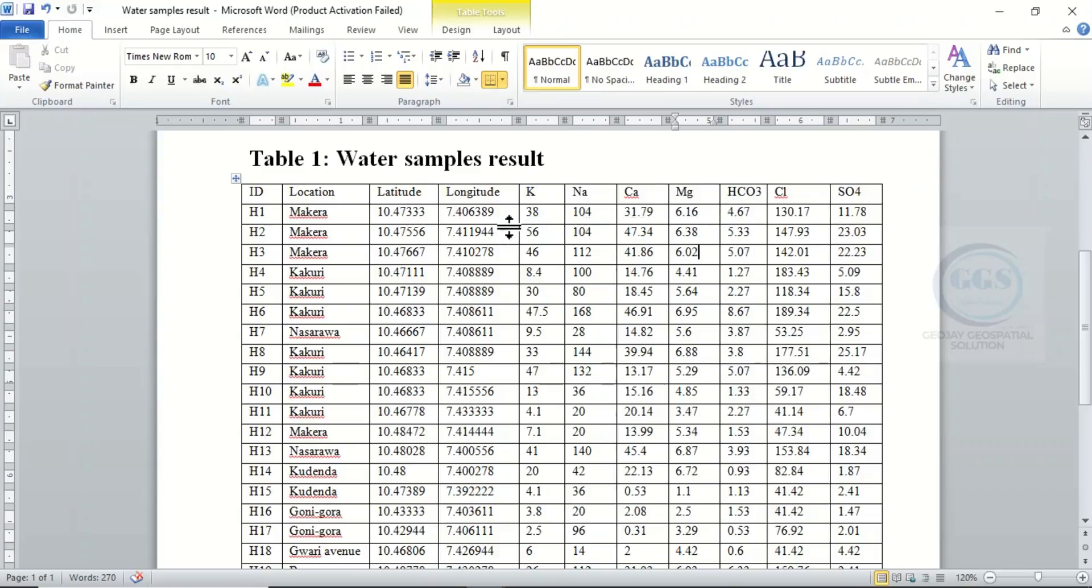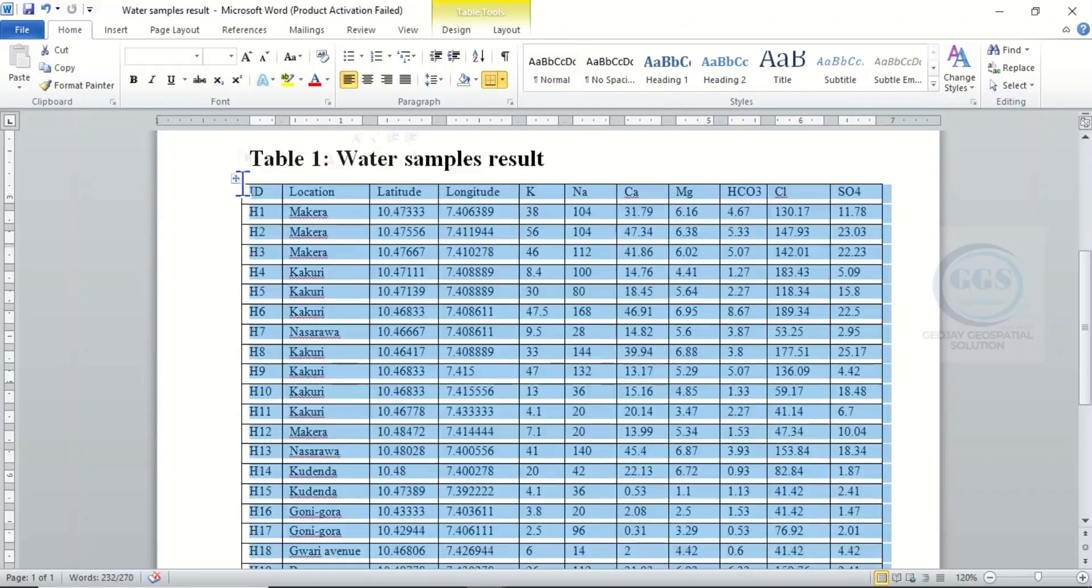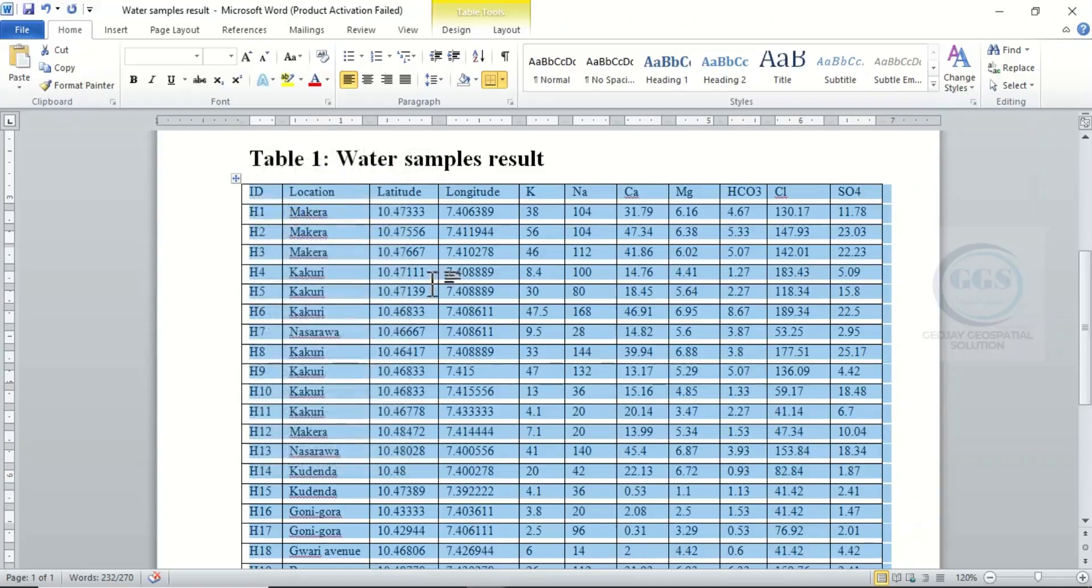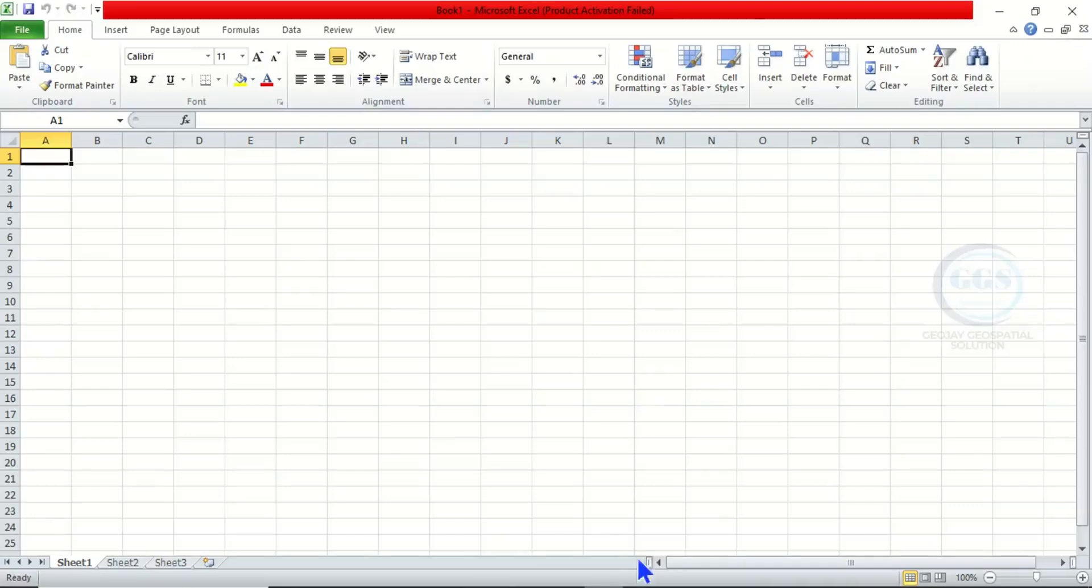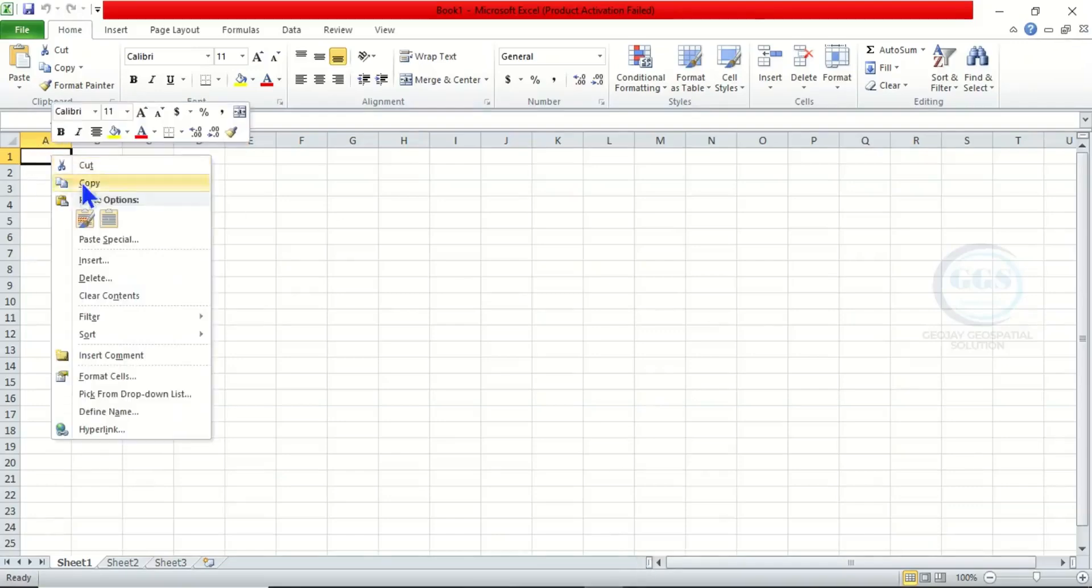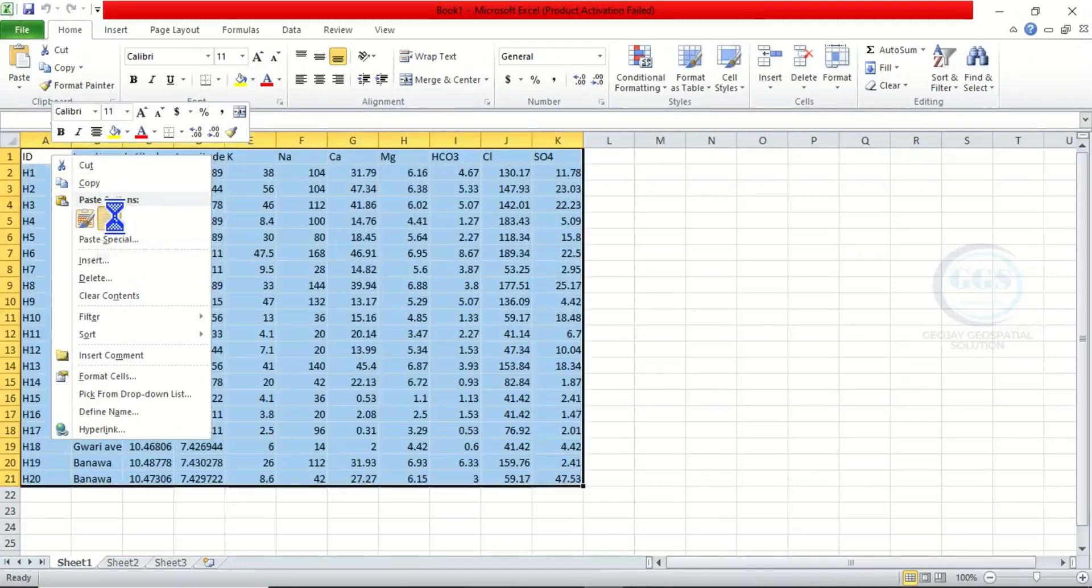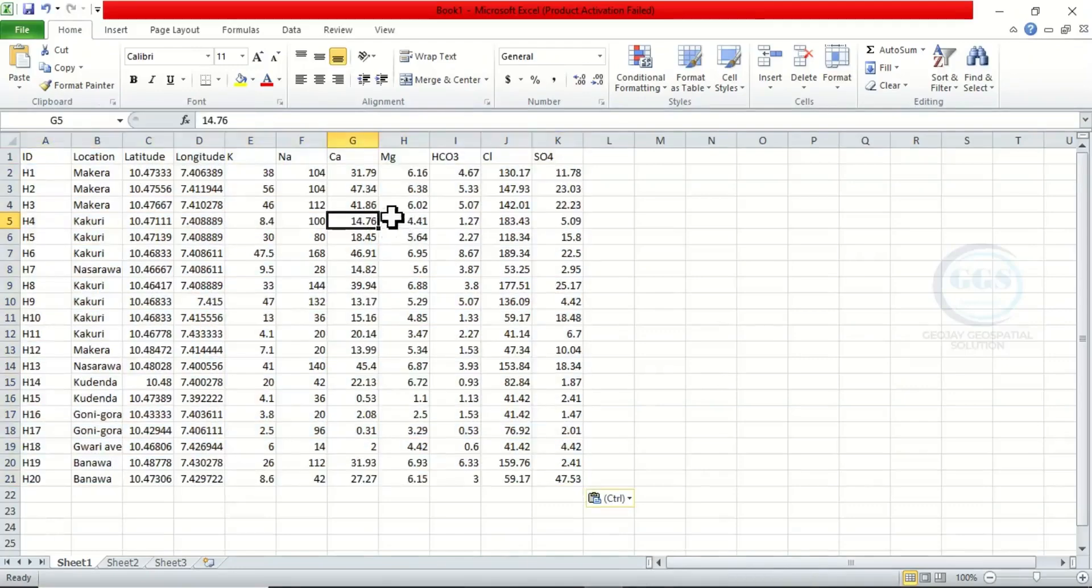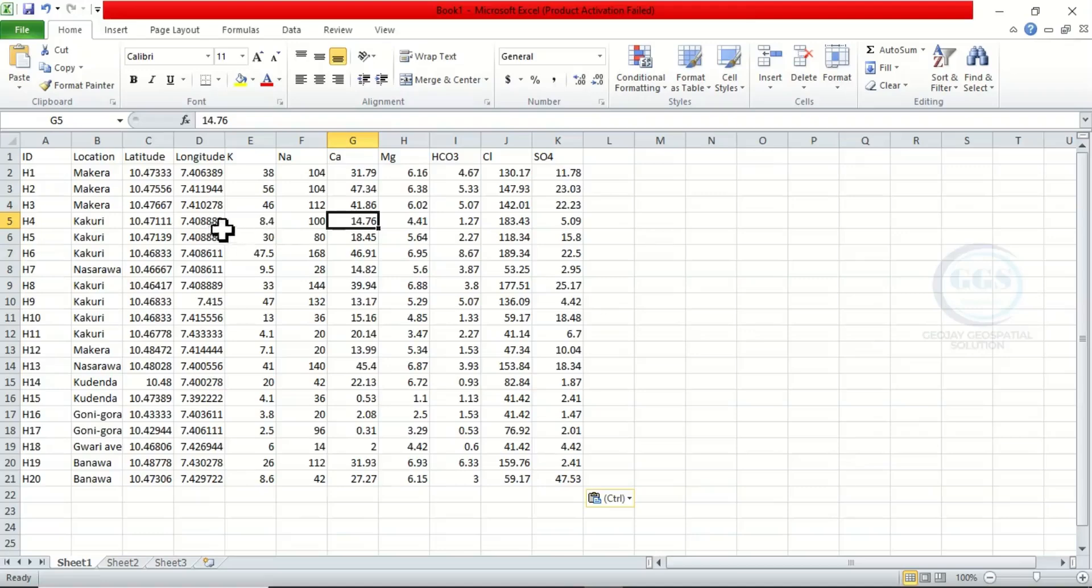After getting your result like this and you want to plot the Piper trilinear diagram, how do you do it? To do that, you need to prepare your data. Copy your data, then open an Excel sheet, right-click and paste the data you copied. Now we have it in Excel format.